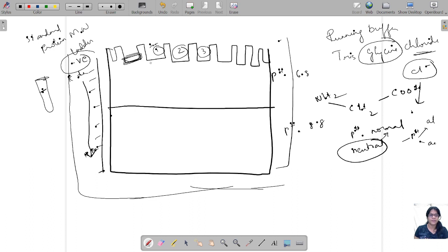When it is placed for electrophoresis and current is applied, the sample starts moving, and the buffer runs through it. When it enters the stacking gel, it contains glycine molecules at the top, proteins to be separated in the middle, and chloride ions, because chloride ions move faster than glycine.